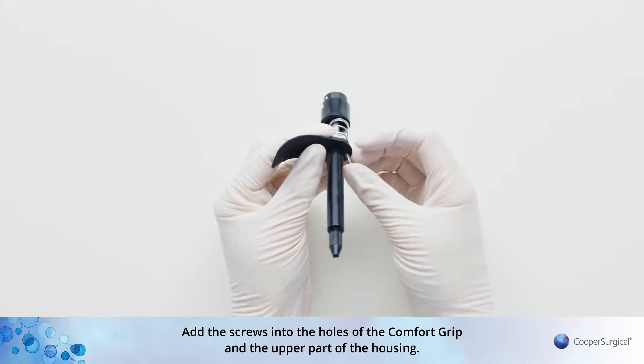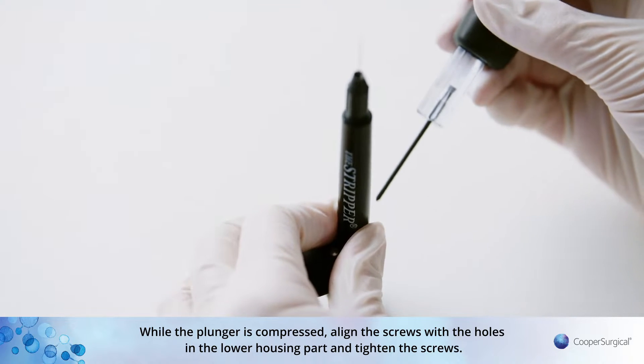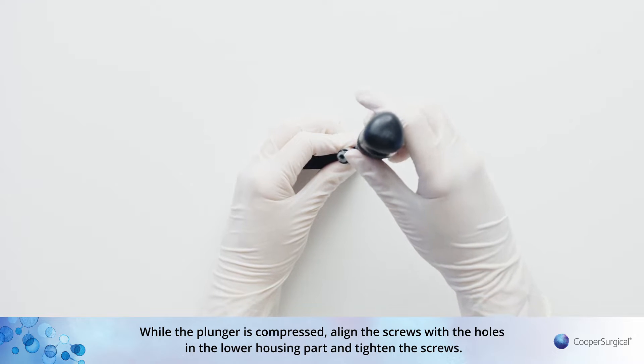Slip the comfort grip onto the barrel with the handle facing upwards towards the collet. Add the screws into the holes of the comfort grip and the upper part of the housing. While the plunger is compressed, align the screws with the holes in the lower housing part and tighten the screws.